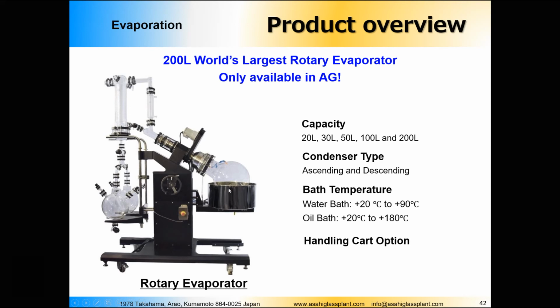So you can clearly see that even when you raise the bath, there is a very big surface of the evaporating flask that is open to the air, and obviously when you start to rotate at a relatively low speed, the mixture that is washing inside the flask will cool down and will not evaporate from the upper surface.